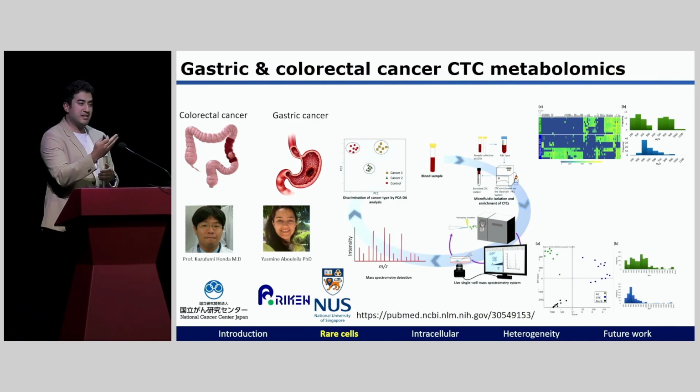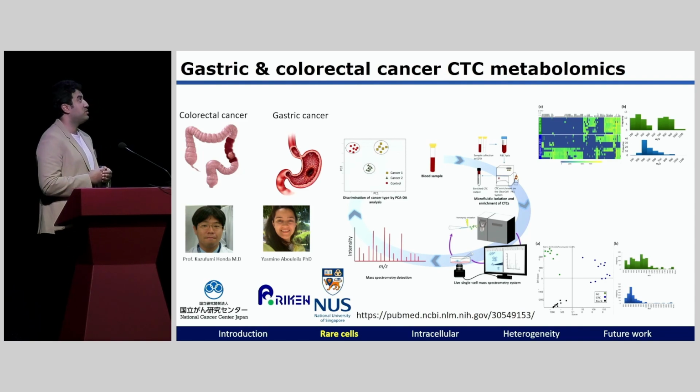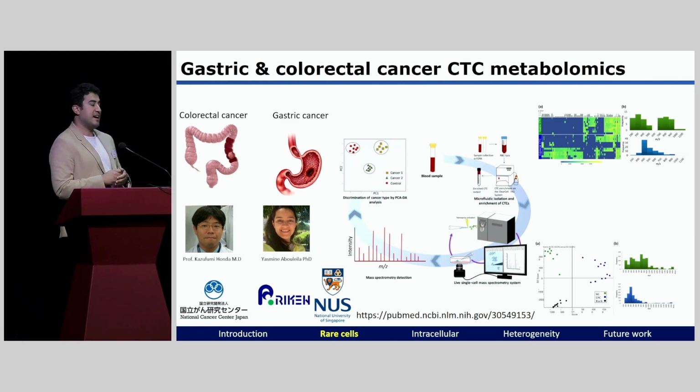Now, the problem that we had, and I think it was just mentioned, is that we need more cells, right? We always need more cells. So we started a third collaboration, and we've been collecting samples for over 3 years now. We have 300 CTCs obtained from several cancer patients, and also, interestingly, the tumor cells that the CTCs originated from. I can't show you anything yet, sadly, but hopefully next year I'll show you the results of this study.